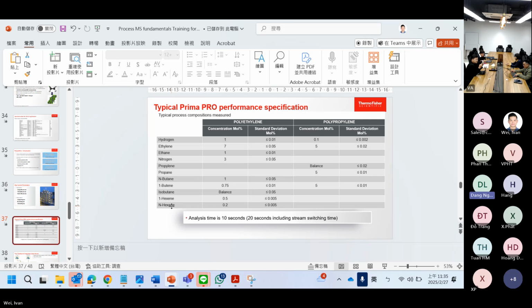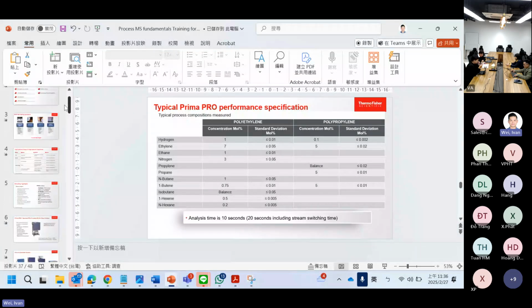Okay. And how can it measure hot gas or dry gas? Sorry, compared to what? As I know, when you measure hot gas and dry gas, you have to sample the gas, if we apply it for CEMS. Okay, so this is different. This is different than CEMS. If you want to do CEMS, that is a different application.